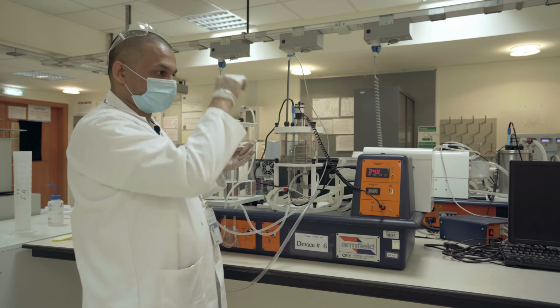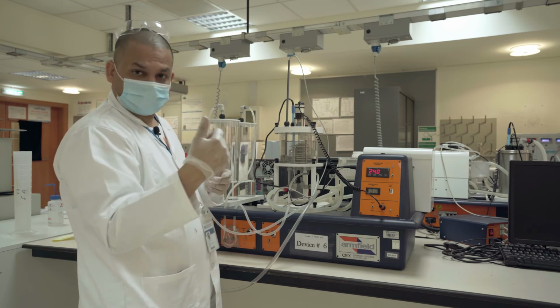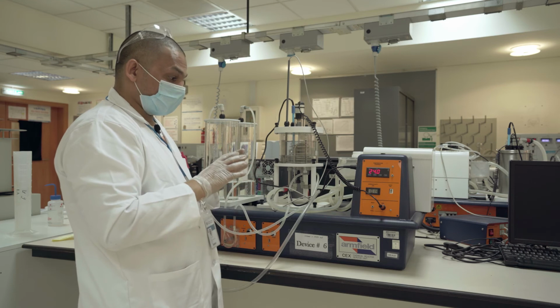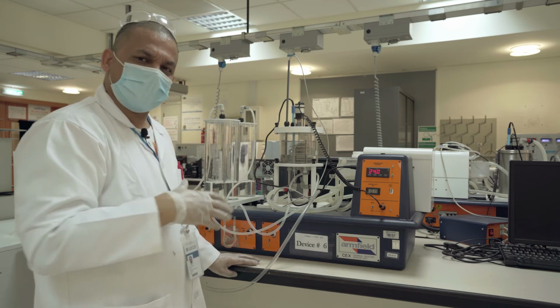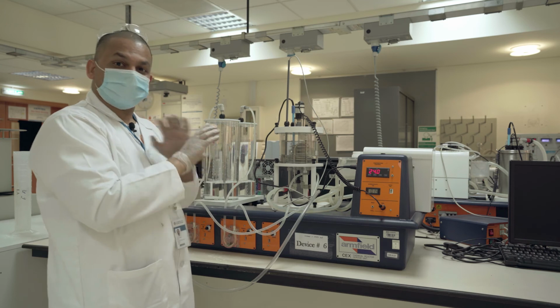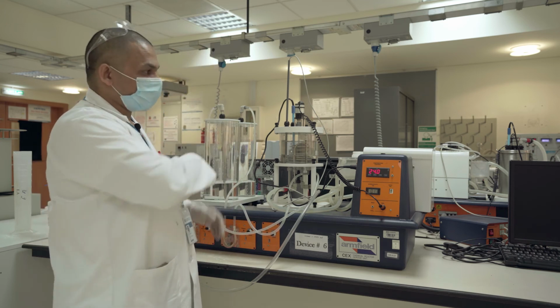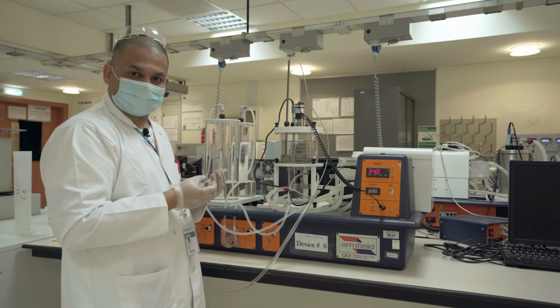So at this temperature, this conductivity; this temperature, this conductivity; plot the curve, take the slope, it will give you the EA, and the intercept will help you to calculate A naught. So what I just tried to say is that you basically don't need all 5 reactors to find out your kinetics. Just one of the reactors is enough to do the entire set of experiments, but we are spreading them out so that you learn them all and then you can use whichever is available to you.